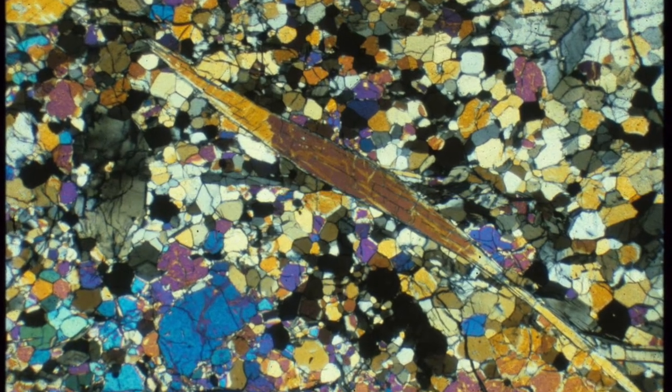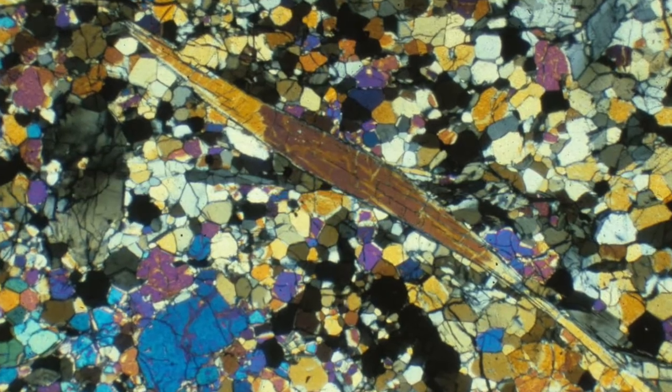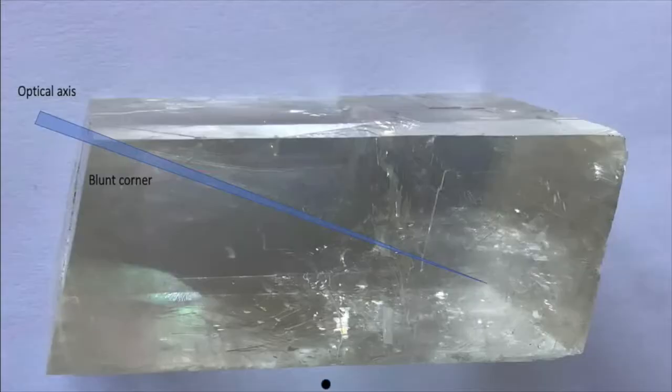They are very useful and make petrographic observations sometimes really amazing. To understand how this interference happens, we need first to introduce the concept of retardation.